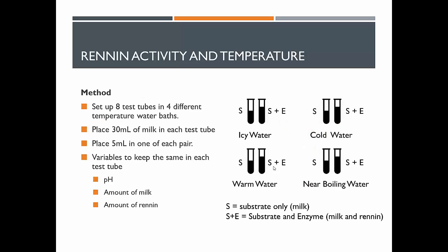Alright, so before I launch into this slide, we should just be pretty clear about what we're trying to achieve here with this video. You're going to conduct 3 experiments, and we're going to give you a method, and we're going to lay this experiment out for you so that you can understand the process that we're going through.